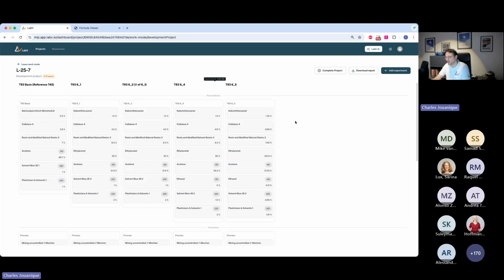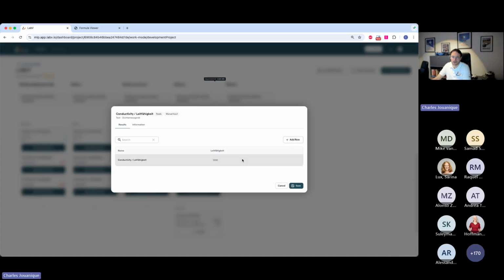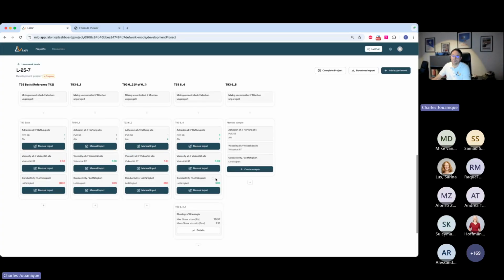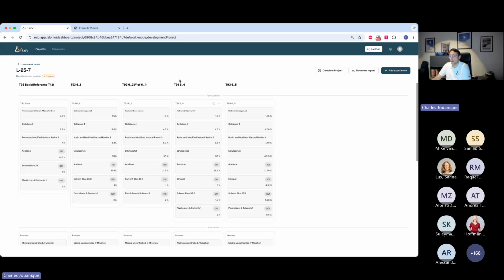Now, we are a typical R&D team. What happens here? Imagine we are happy with the result. Imagine this one wouldn't be 1200. It would be maybe, we could even change it if we want. Don't tell my team. It would be 995. Right? So now it's basically everything in the range, so I'm happy with the result and the customer should be satisfied as well.